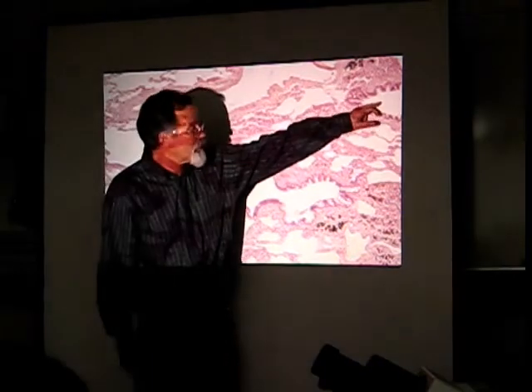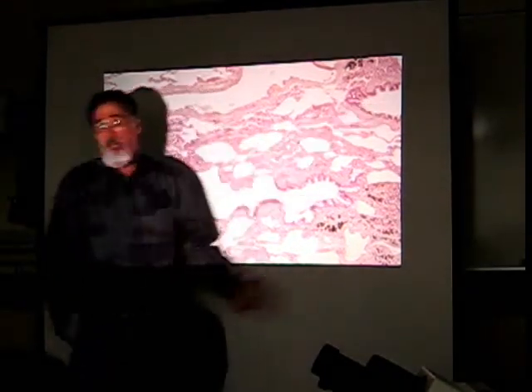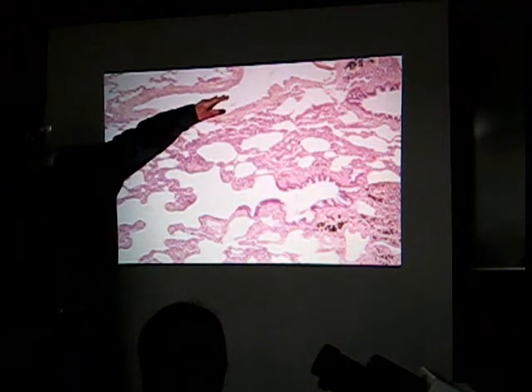Here is, you know, not a great micrograph. Clearly we've got what here? Yeah, bronchiole associated with the pulmonary artery. Remember that if you see a bronchiolar profile, you start looking for a vessel associated with it, because the pulmonary artery runs in parallel to the bronchial tree. The pulmonary vein runs in the connective tissue septa between lobules of each lung lobe.